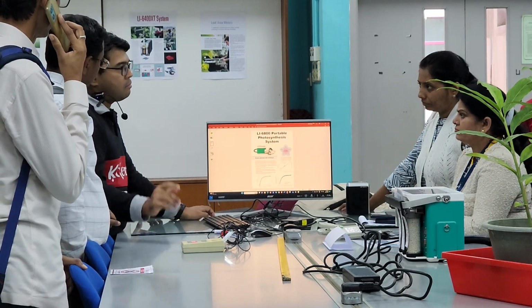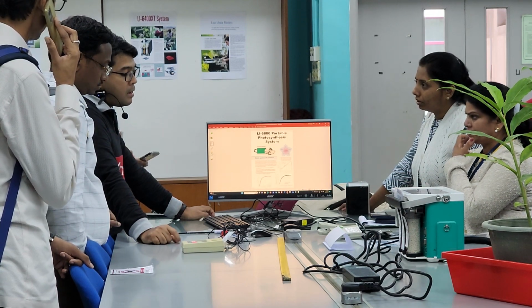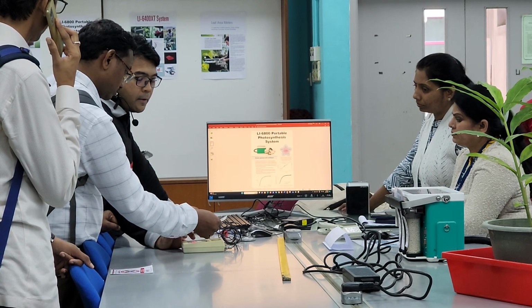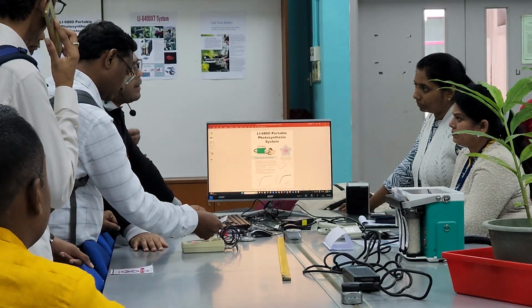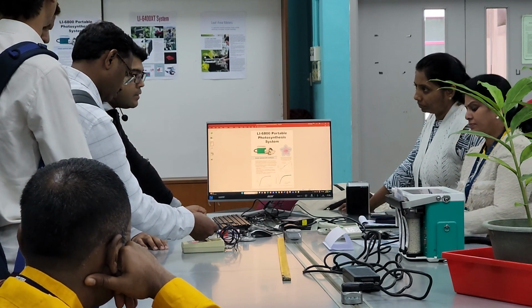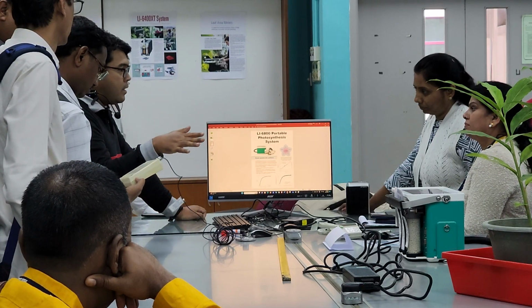10 years, easy. How many intervals for one observation? You can actually set that here. Actually, that depends on your study. For example, if you are studying RUE, radiation use efficiency, it is advised that you don't only take one reading during the day.